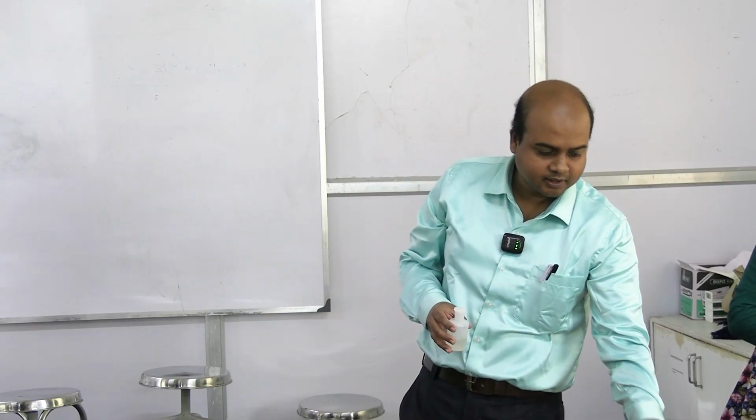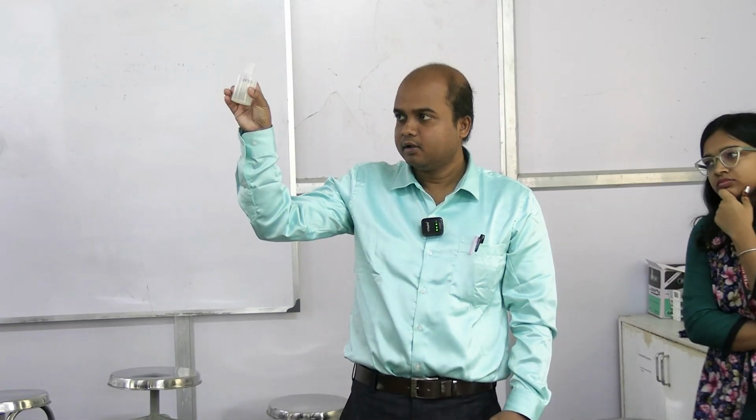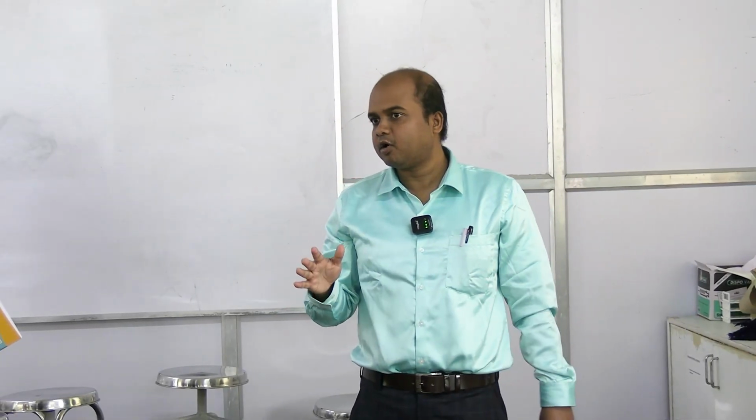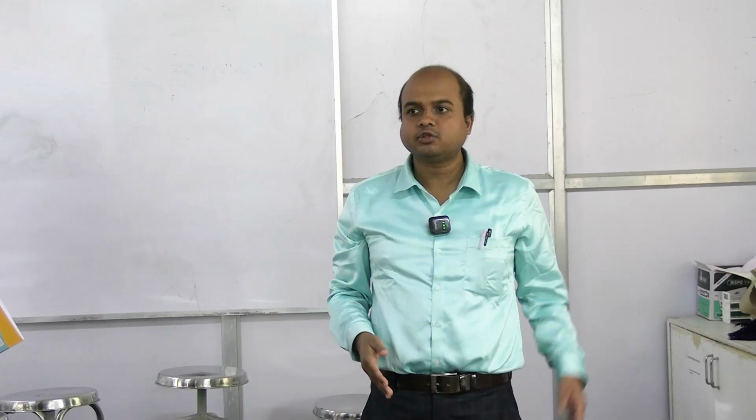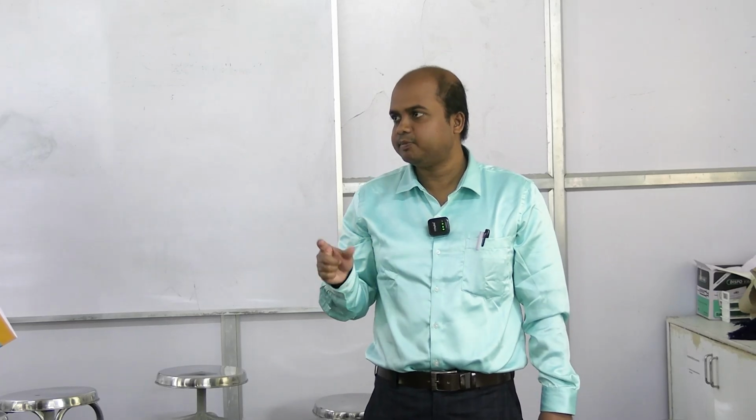This is the Leishman stain, and after applying the stain, after 2 minutes, we have to apply either distilled water or buffered water. This is the buffered water available over here. Now, while applying the stain, we will show it over there. We have to count the number of drops, because of the importance of counting the number of drops to be sprayed over the smear to stain it.